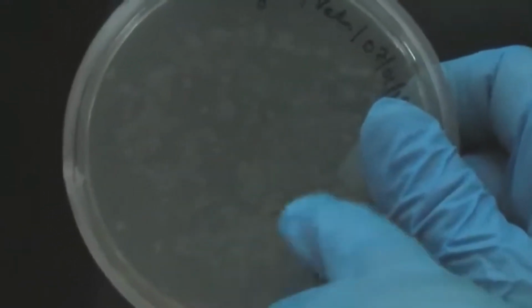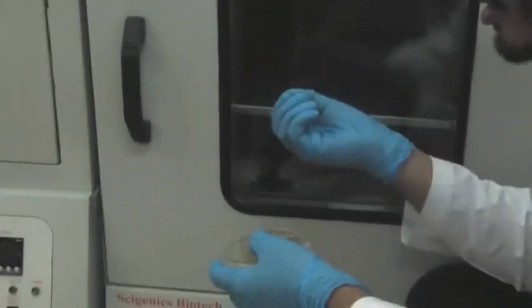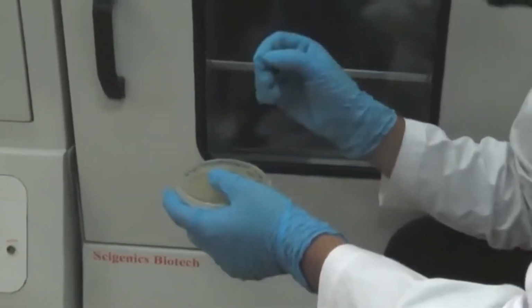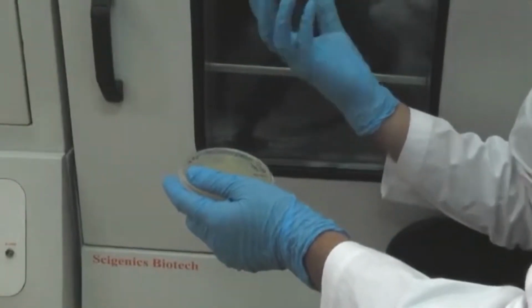See, even this has a lot of bacteria, but you will see that the sizes of the colonies seem to be a bit bigger. Also notice that there will be some colonies which are merged together, so maybe two colonies side by side. I don't know if you can see it here, but when working you might see two colonies growing too close to each other, and when kept overnight, they might just merge and create a larger blob. So, when you are going to pick single colonies for your experiment, make sure that you avoid picking such merged clusters of colonies.